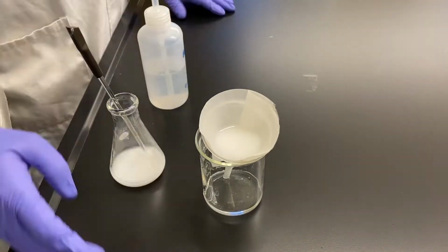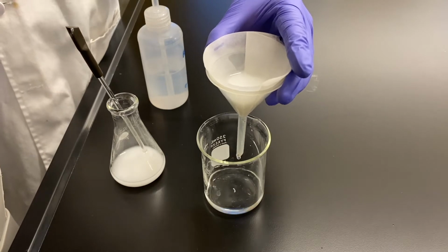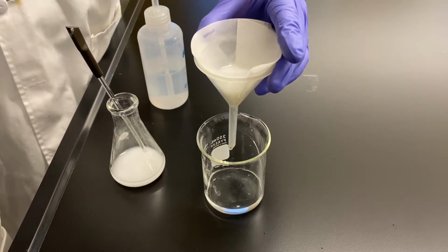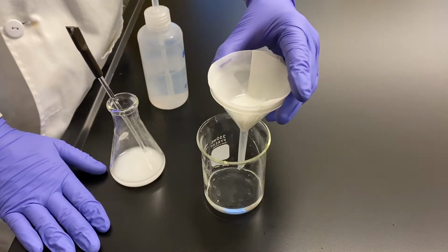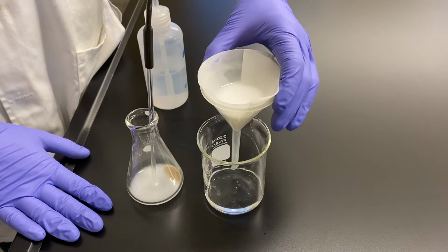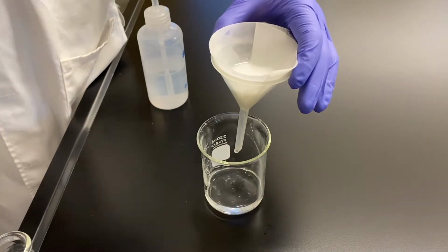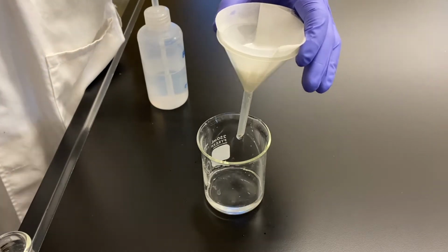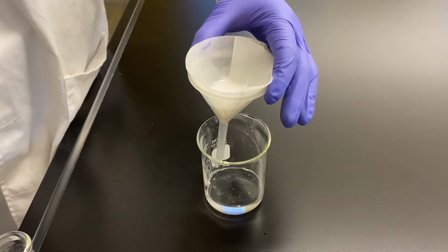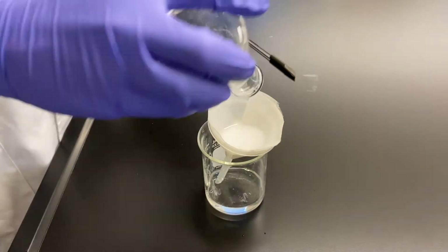All right, so you'll see every time we're about to pour more of the solution into the filter, we give it a swirl. We want to get a nice slurry. We want to make sure all of our little particles and everything that's in solution is nicely mixed up and not stuck to the glass. You also notice when I'm pouring the solution, I put that stirring rod, so you're actually pouring onto the stirring rod. That's called decanting. It helps all of the liquid get into the funnel instead of spilling some of it on the side of the flask while you're pouring.